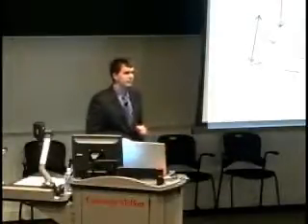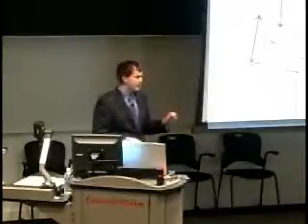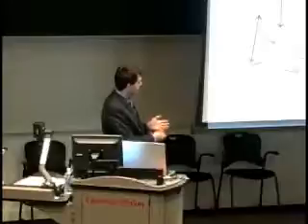Here on the right, you can see the solution that we would get if we just use the linear filter to initialize the ribbons. You can see that we can't enclose the cellular boundaries correctly, and this is why we need some nonlinear registration process that can push the ribbon towards the right solution.